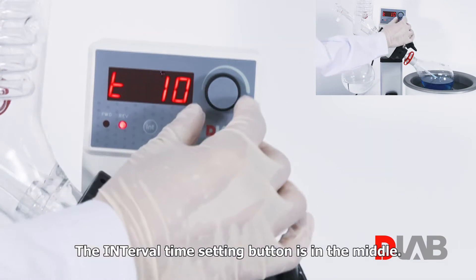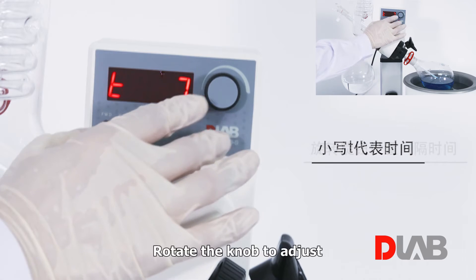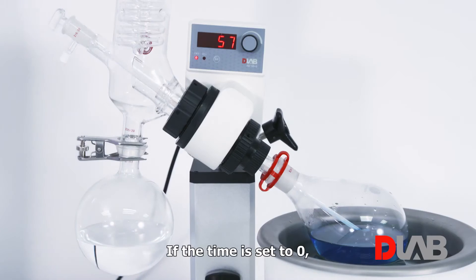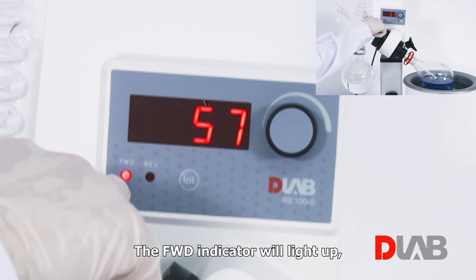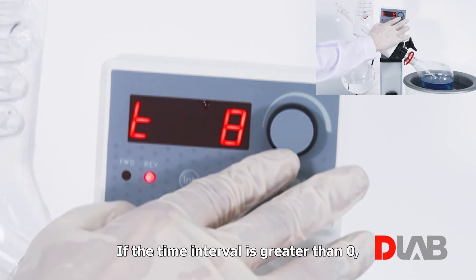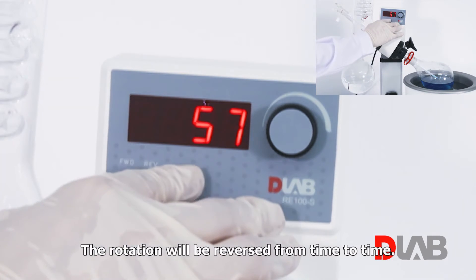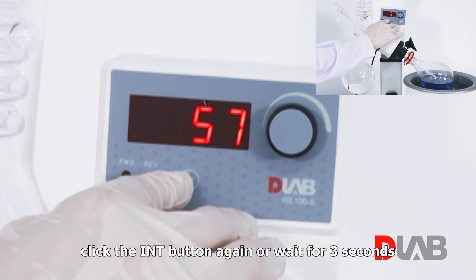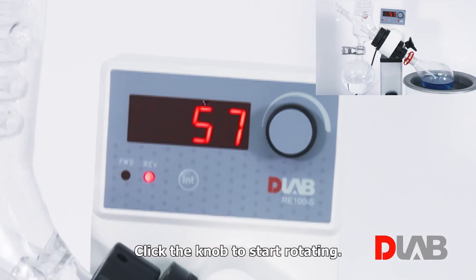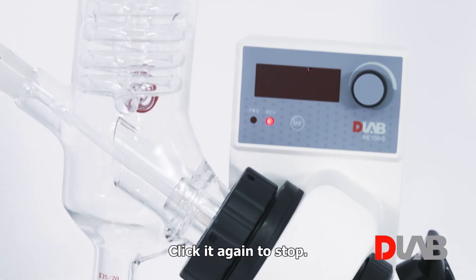The interval time setting button is in the middle. Click it to adjust the interval time between reversal. The letter T in lowercase stands for time. Rotate the knob to adjust the time from 0 to 999 seconds. If the time is set to 0, the forward indicator will light up and there will be no reversal rotation. If the time interval is greater than 0, the rev indicator will light up and the rotation will be reversed from time to time. Click the INT button again or wait 3 seconds to exit the setting, then click the knob to start rotating.